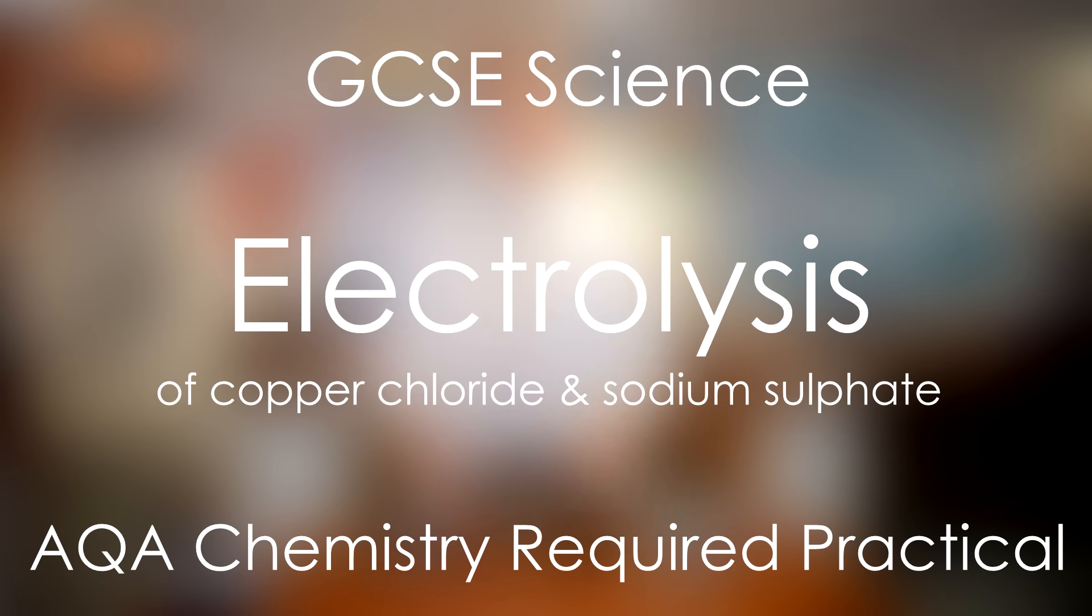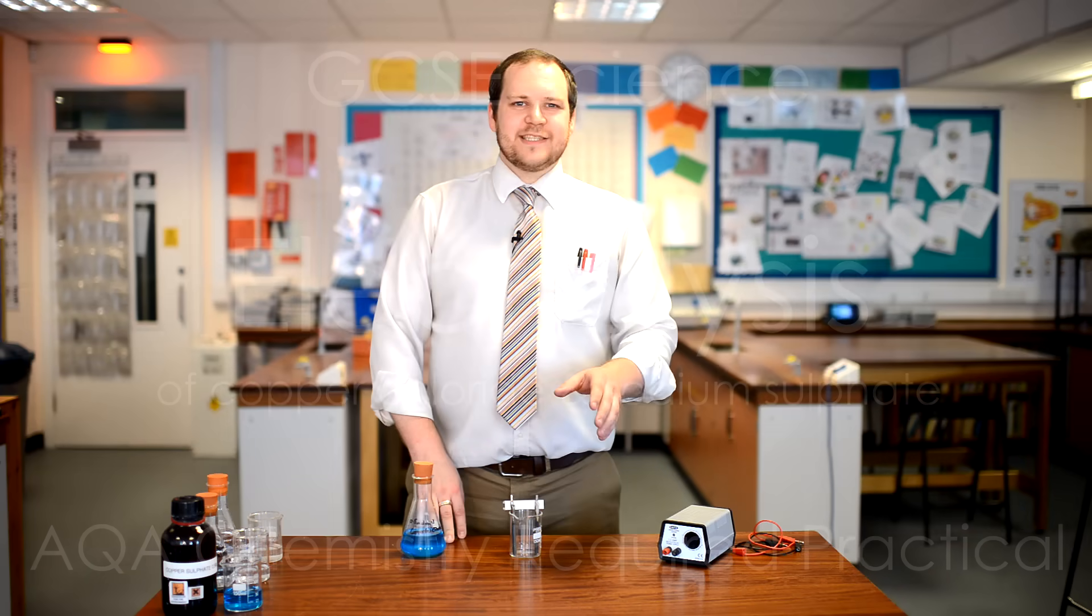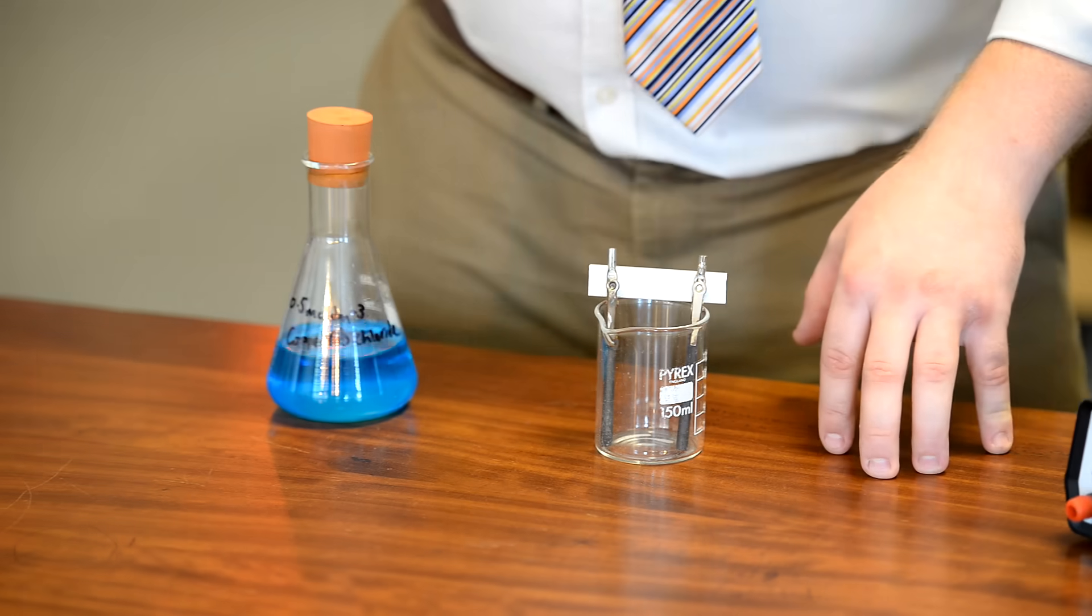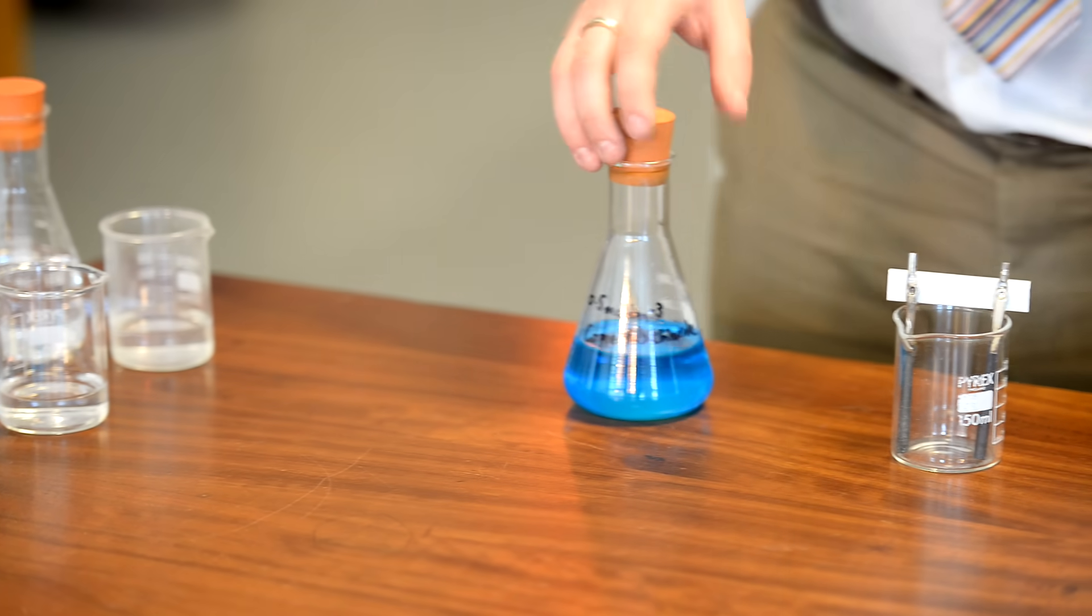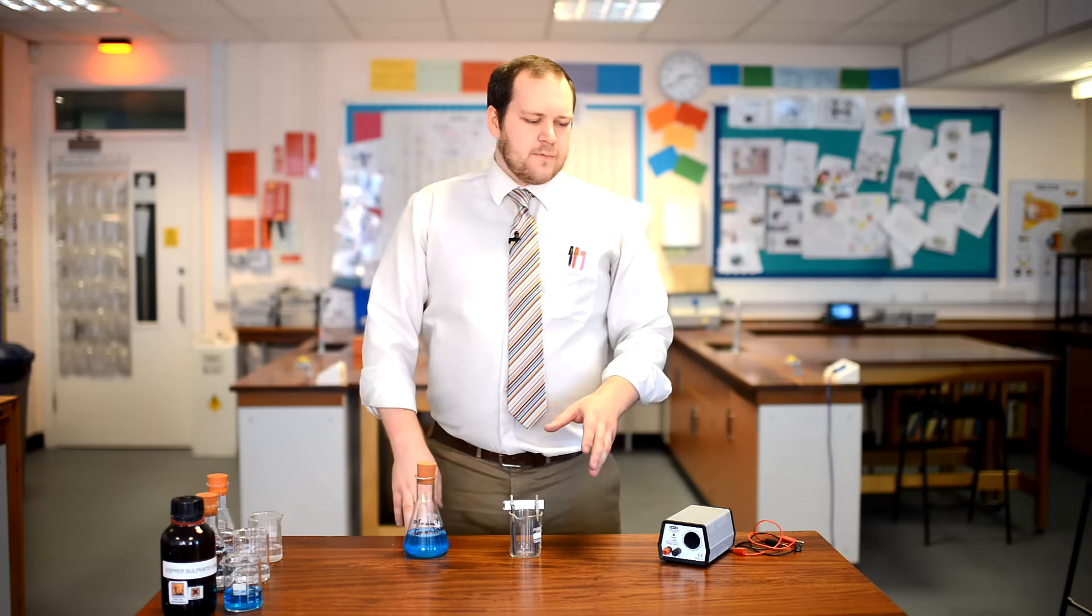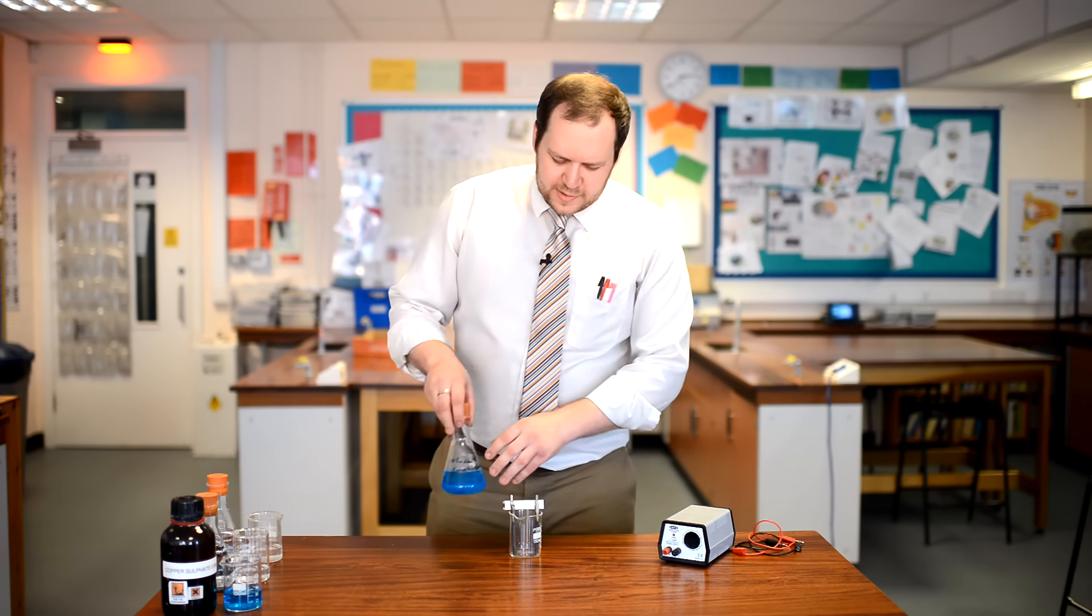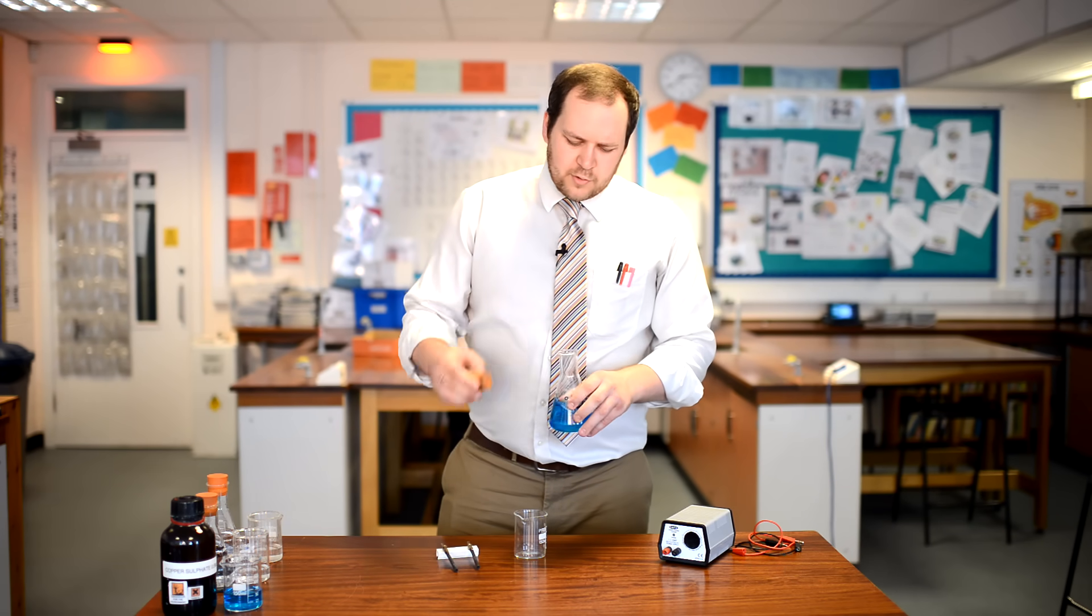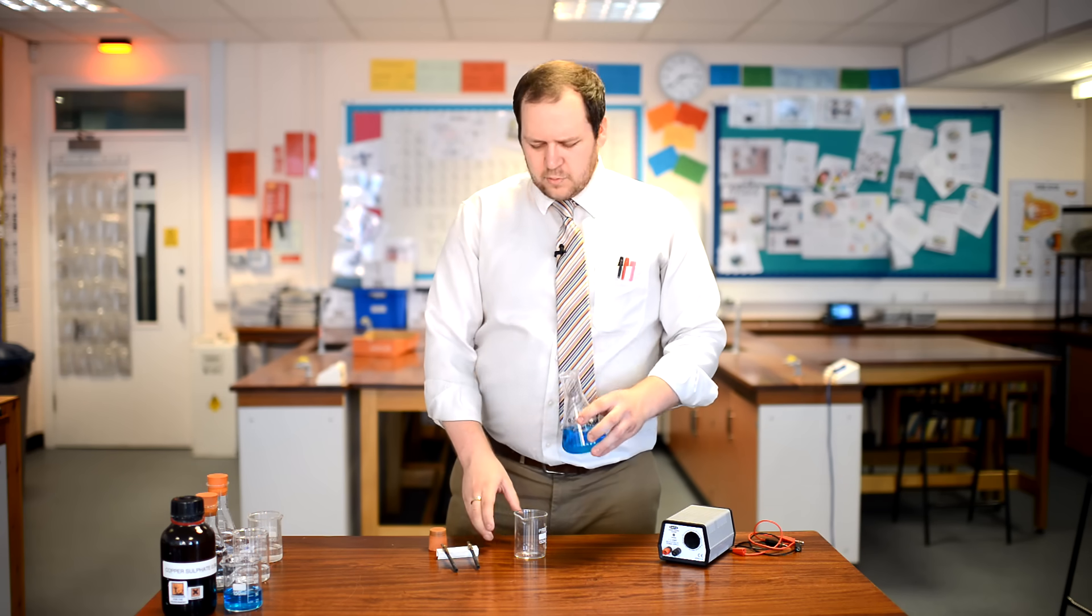So today we're going to be doing an experiment into electrolysis. Electrolysis is used to break down compounds using electricity. Now today we're going to look at copper chloride and sodium sulphate. The first thing you need to do is fill your beaker about 15 centimeters cubed using the chemical you want. So we're going to start with copper chloride.